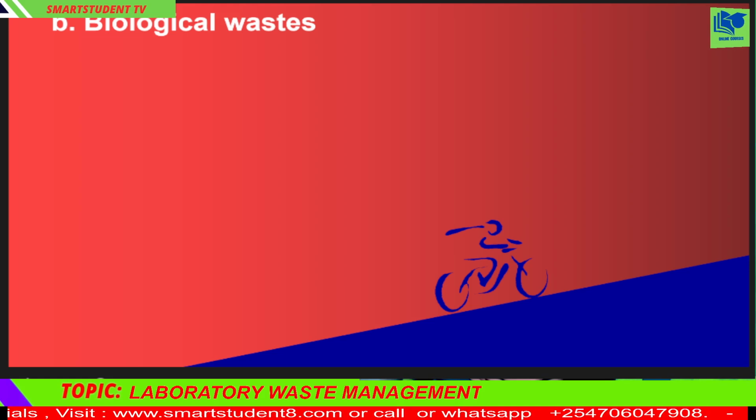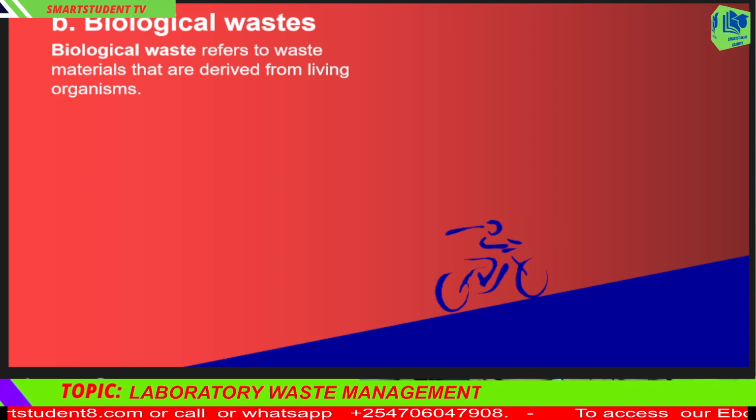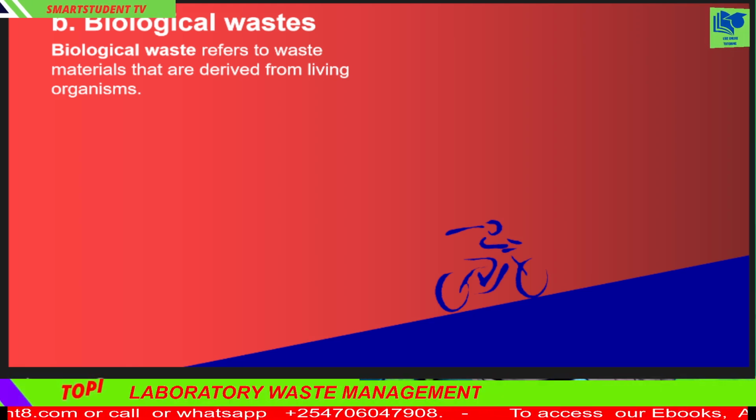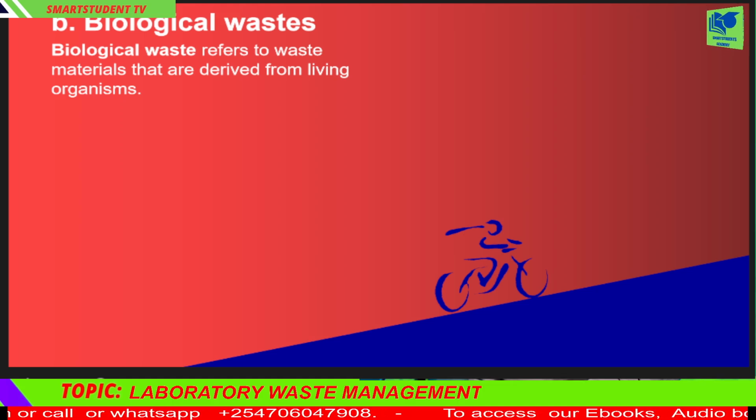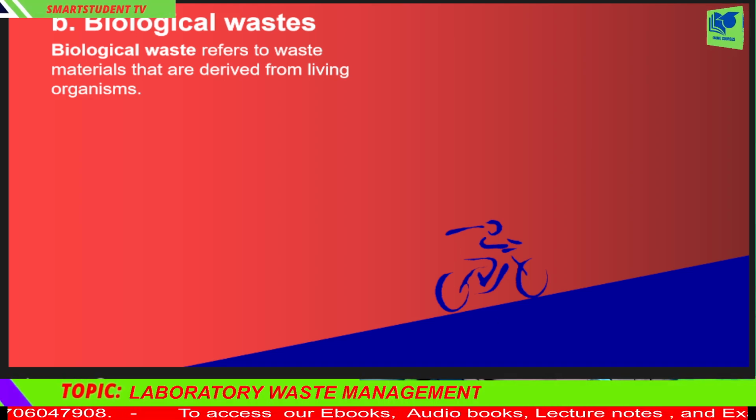Biological, biomedical, and infectious waste management is a critical aspect of healthcare and environmental safety. With the rapid growth of healthcare facilities, laboratories, and research institutions, the volume of waste generated has significantly increased. Proper management and disposal of these wastes are essential to prevent health hazards, environmental pollution, and the spread of infectious diseases.